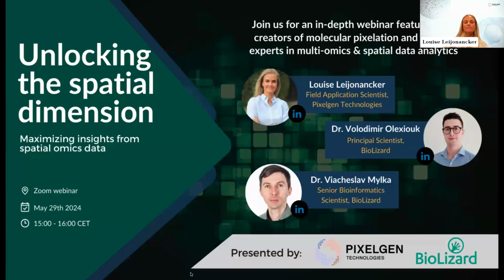Fantastic. Thank you, Vladi and Slava. So important to be able to have tools to analyze your spatial data in this day and age. We do have a question from the attendee. So for the different omics platforms, how do you account for the difference in resolution?